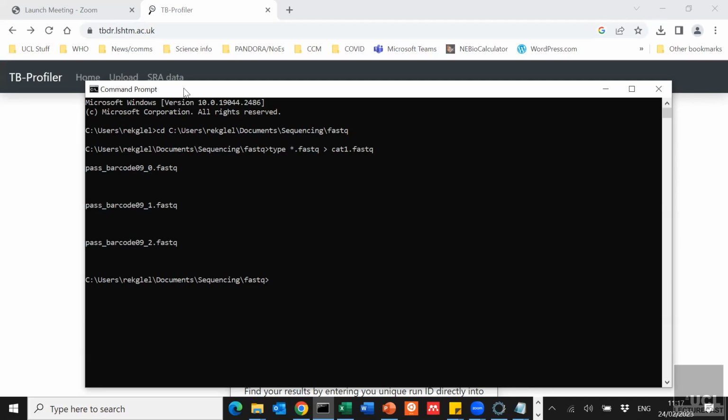So when you get them, it's not very easy. So you can check, you can just list it and see your top one. And you can check that.